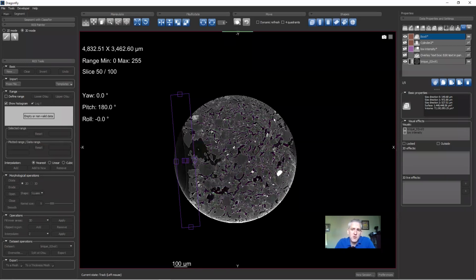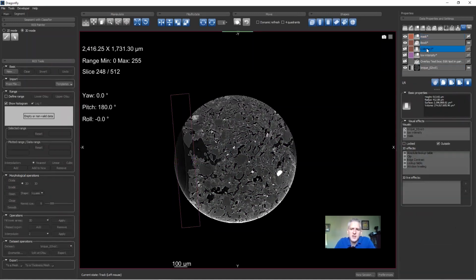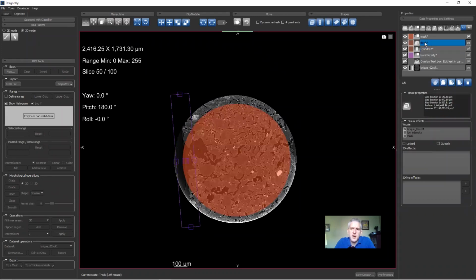Now I want to show you a slightly different way of doing this. If I did have a new ROI that was the same shape as my data set, so I'm going to say as dataset brick, and let's say I call this my mask object, and I do click OK. What I can do is I can take cylinder and I can add it to an ROI. So I could add this to mask, okay? And then you see it's added everything in the cylinder, and then I could take box and I could, just as we did before, remove from ROI. So remove from ROI, which one? I will choose mask and click OK.